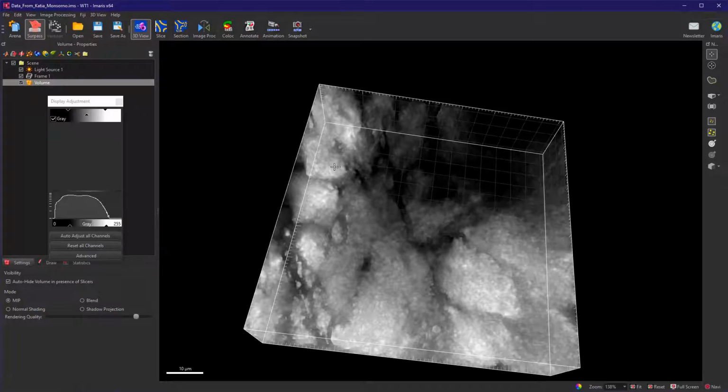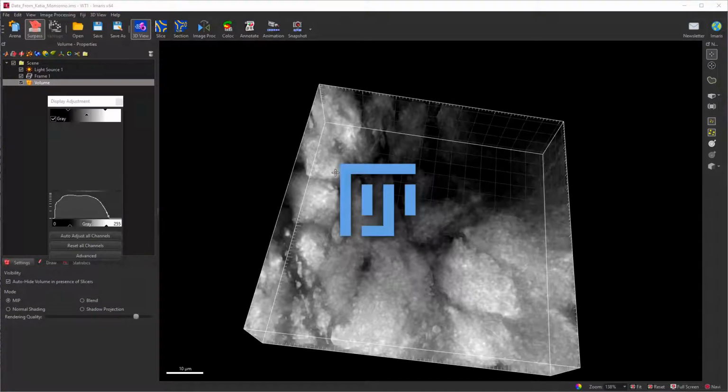So this takes a few minutes. Don't worry, sometimes the image displays quite fast, but the interface of Fiji takes a bit more time. So you just have to be patient, but you should finally see the full Fiji object.